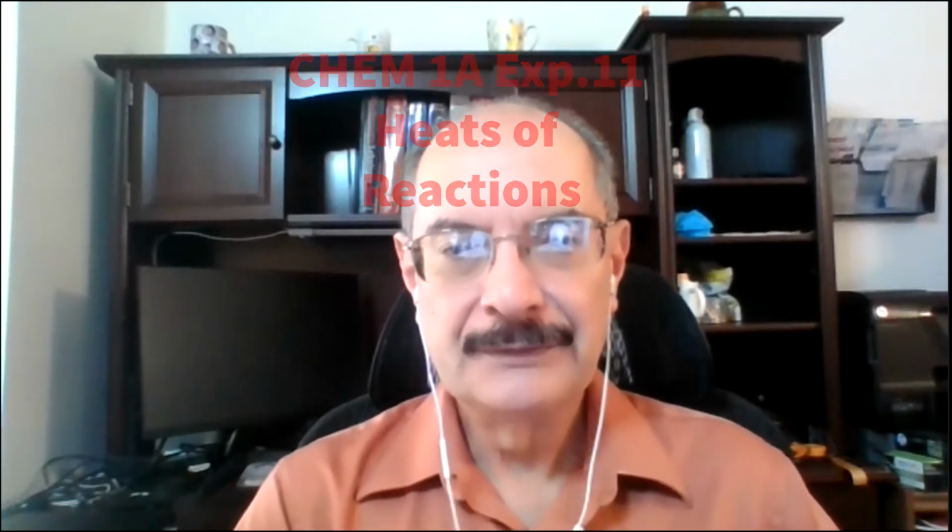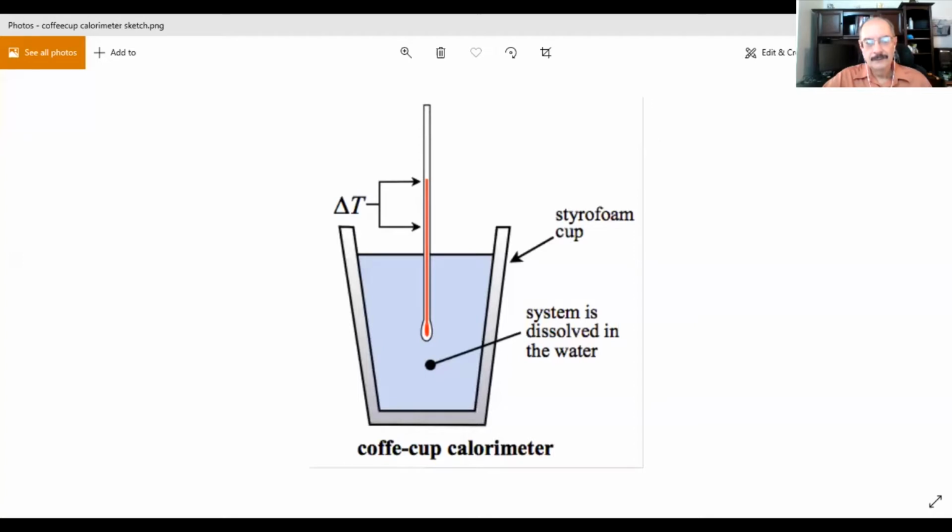Welcome back, students. This is going to be the final part of our study of heat of reactions. At this point, you have already done your calorimeter calibration. And remember that we are going to do the following. This is our setup for this particular experiment.